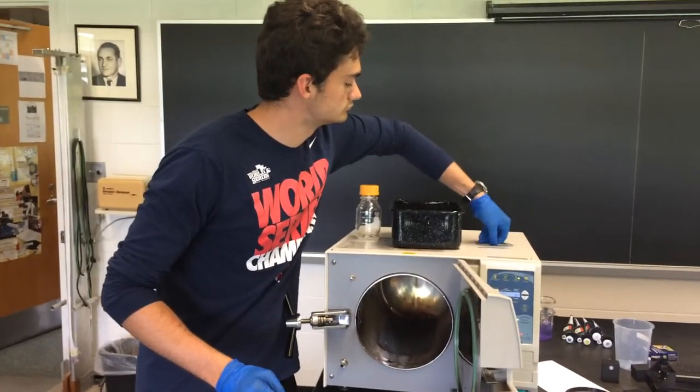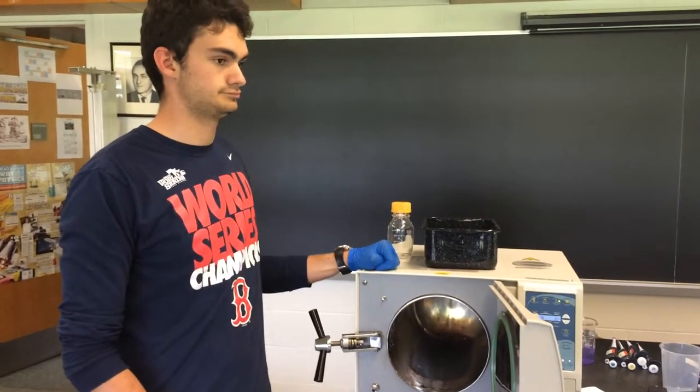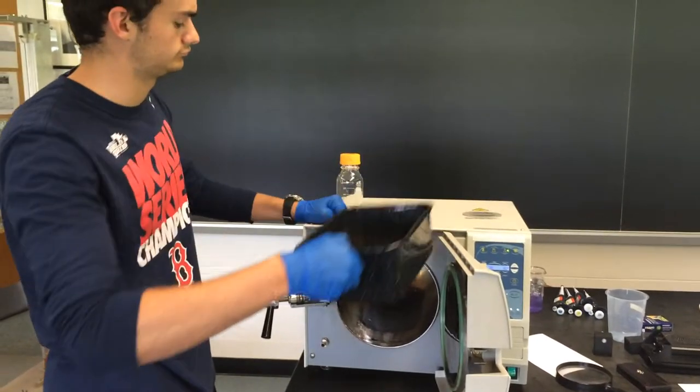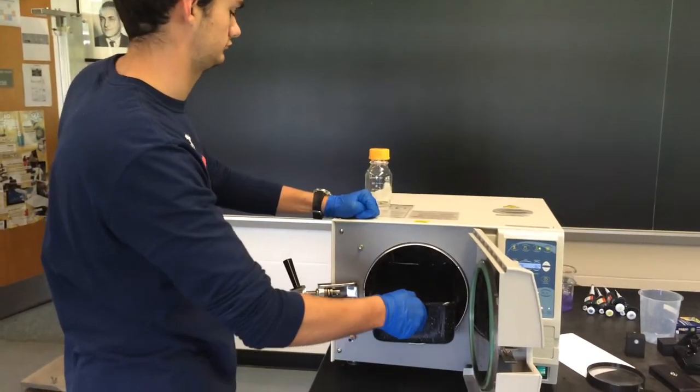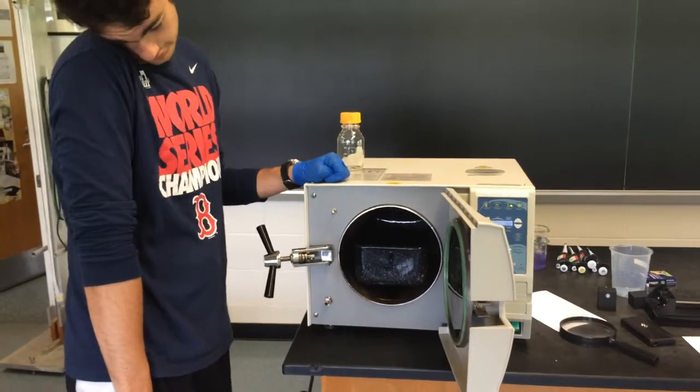If there isn't enough, just get some deionized water and add it to that. Before you start, also put a tray in the autoclave to collect any extra liquids that might overflow from your containers. This is not a tray that you'd want to use, but this is the only one we can find right now.